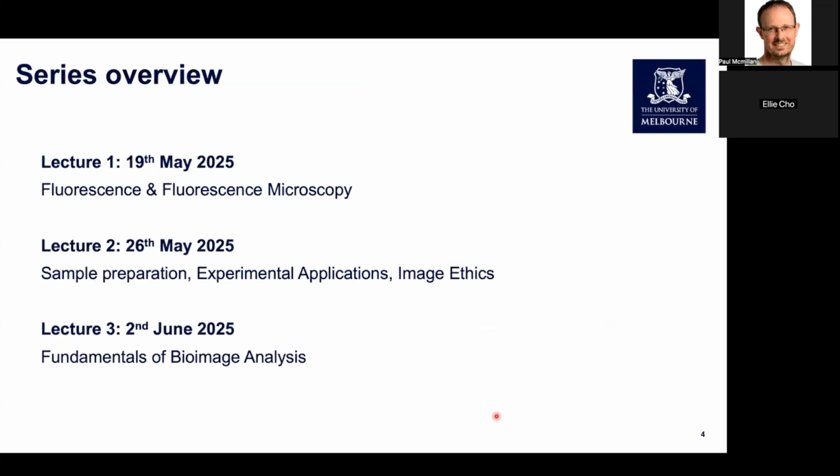So I mentioned that today is the first of a series of 3 different lectures. In today's lecture, we're going to cover fluorescence and fluorescence microscopy. This time next week, we'll cover sample preparation, some of the different experimental applications that are possible on optical microscopes, and a little bit around image ethics as well. And then in 2 weeks' time, my colleague Ellie Cho will be presenting the fundamentals of bioimage analysis as well. Hopefully this gives you a good fundamental understanding of the fluorescence microscopy workflow.